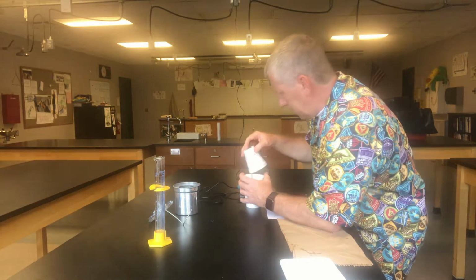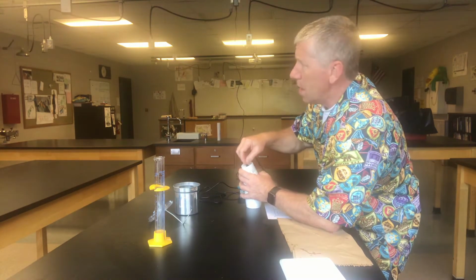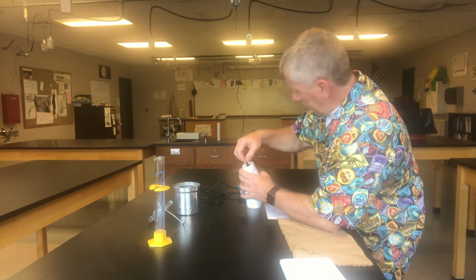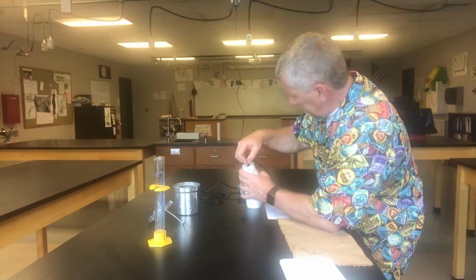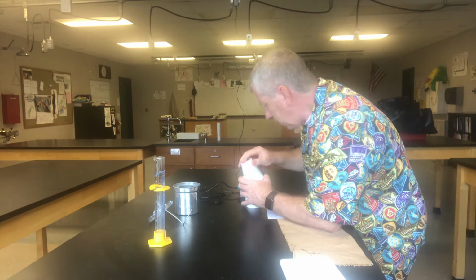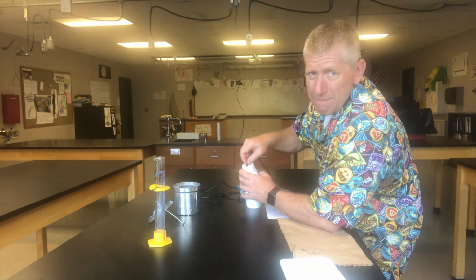Okay, come on, ice cube. Oh, it's almost melted. I think we're going to be okay. Of course, I do have to let some ambient air in as we mix. Okay, we're at 22.0, 21.9, 21.8, 21.7, 21.6, 21.5, 21.4. Still going down. So we're mixing this. It's beginning to slow a little bit. Okay, let's see if the ice is melted. Not quite. Usually we want it to melt in under a minute.